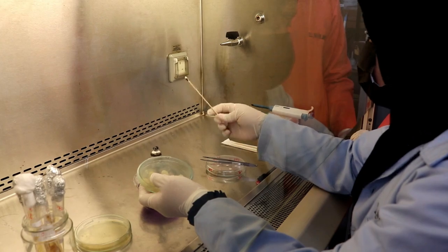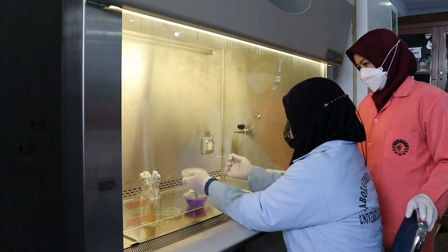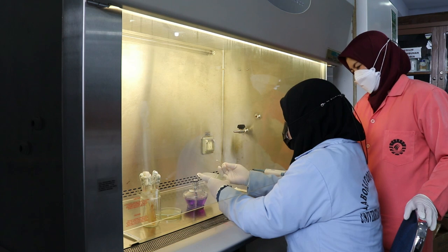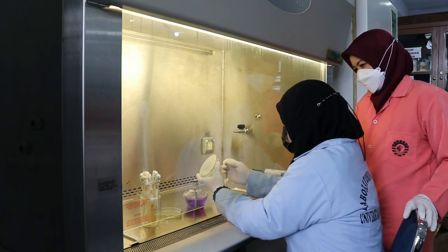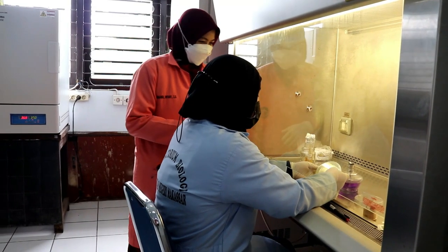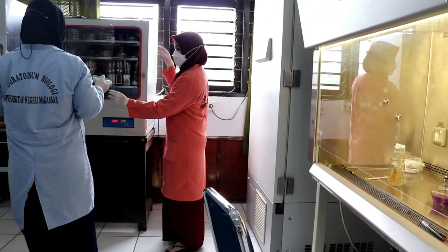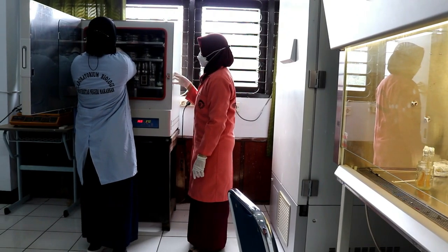A biological safety cabinet is a laboratory work area with air ventilation designed to protect workers, the environment, and material samples from contamination or the spread of pathogenic bacteria or viruses. By expelling the air through a HEPA, or high-efficiency particulate air, filter, a BSC creates an air inflow to protect operators who are handling risky biological samples.